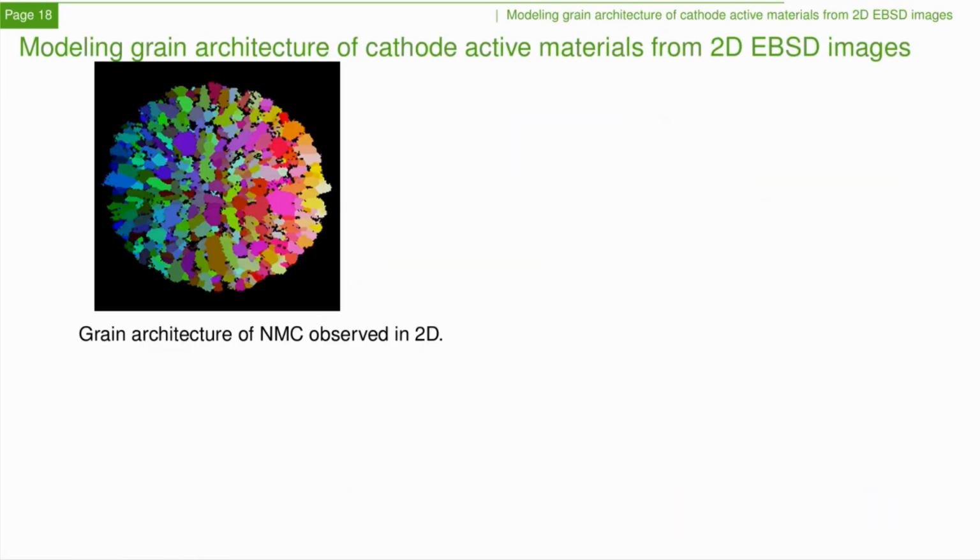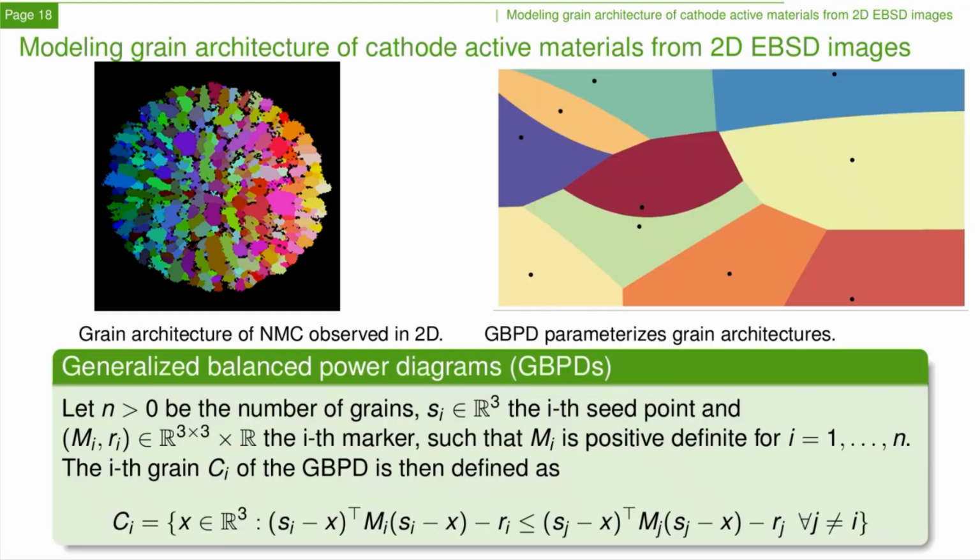And my last example is on polycrystalline materials. So here we had 2D image data of the polycrystalline microstructure in NMC cathode particles. And here you can see individual crystals colored in individual colors of this particle. And we only had this information in 2D. First of all, we represented this pixelized polycrystalline microstructure with a low-parametric geometry model called a tessellation model. And with that, you have a huge reduction of complexity.